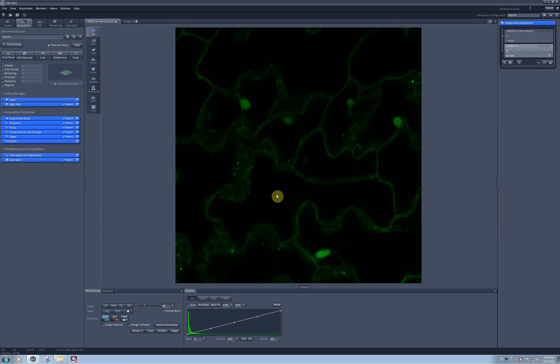Linear unmixing can help you better distinguish fluorophores on your image with slightly overlapping spectra. It is useful not only when you detect several fluorophores, but also when there is autofluorescence in your sample which creeps into the detection range of the fluorophore you want to see.